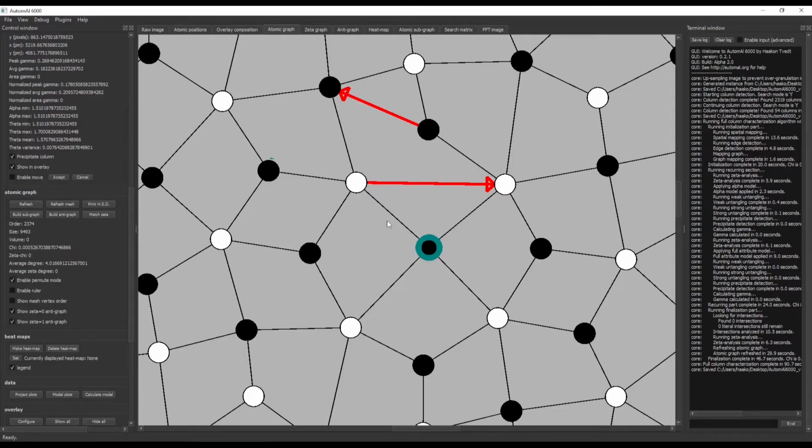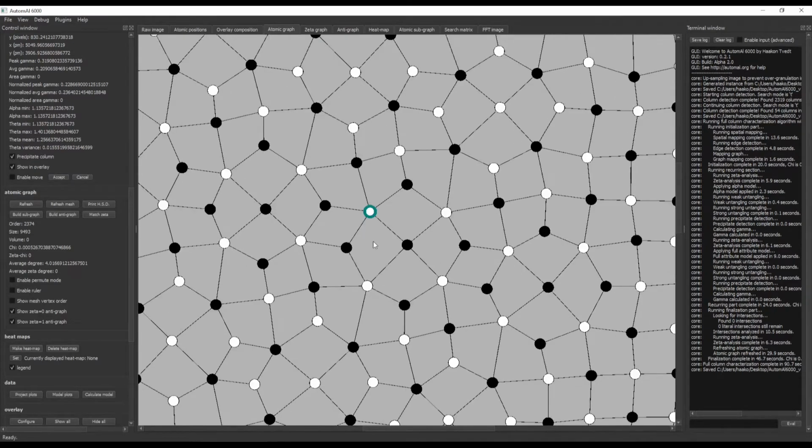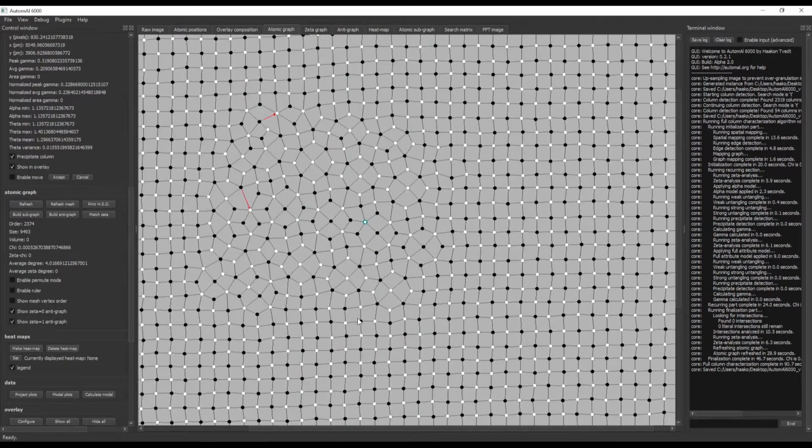And to remove this completely and make a 4-sided mesh, I can go this there and this there. And so that's an important tool. And of course you may want to check that actually every single mesh is 4-sided if it is a coherent structure you're looking at.